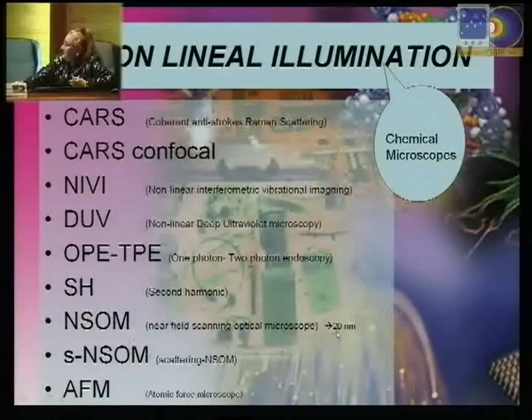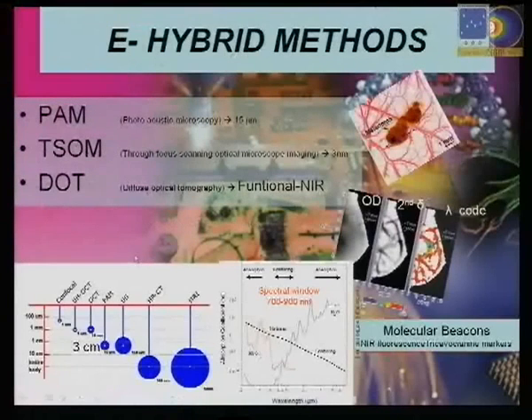But you get, on the other hand, a very high resolution of 20 nanometers, the scattering near-field scanning microscope, and obviously the atomic force microscope. But the interesting things are the hybrid methods.